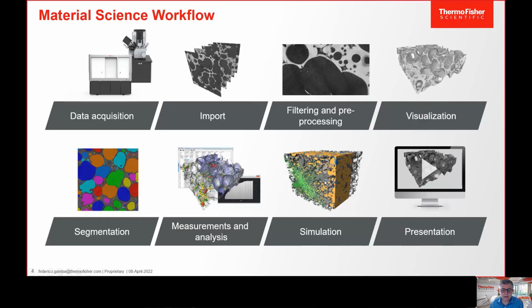Some people do it inside our tool, some people do it outside our tool, because they may already have their own simulator, and so they just export the geometry from here, do the simulation outside, and re-import the data into Avizo to do visualization of input and output in the same place. And finally, you have a part that is important, which is how to present your data, your numbers. If you do papers, if you do presentations, it is important. So that's the standard workflow.